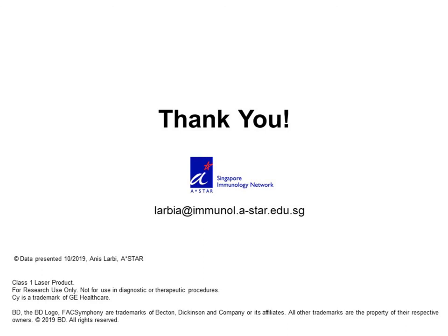Thank you. What colors were used for the extra TH and ICC markers? Okay, so for these additional markers, we mostly used the same fluorochromes with different antibodies. It's really based on the cheat sheet that I showed you.